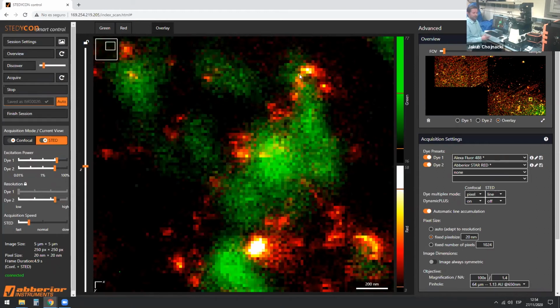That was already an important discovery for us, because we found out that the clustering, the disposition of those envelope proteins on the surface, is very important for the virus to be infectious. Those proteins need to be clustered into one small cluster for the virus to be infectious. This would not have been possible with standard fluorescence microscopy. Only we were able to discover this using this advanced super-resolution microscope.